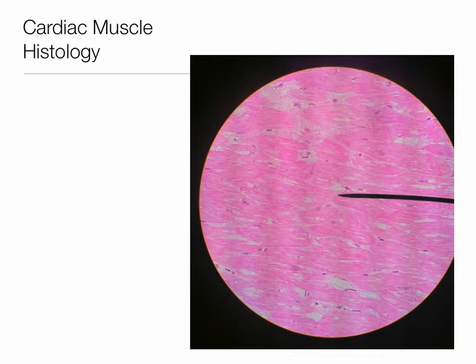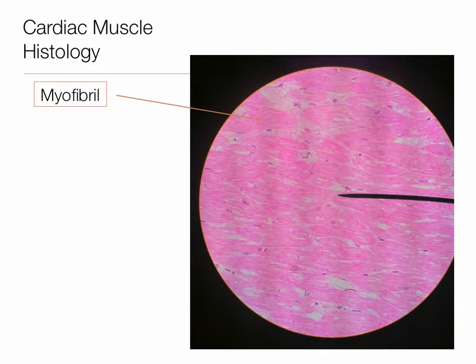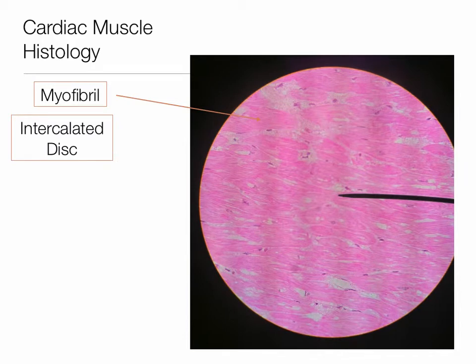You can see the black arrow-shaped marker built into the microscope that allows you to pinpoint and mark things. You can see there's a thinning of the cell and a kind of line that seems to separate one cell from another — you see that appear all over the place in this sample. This little line is a characteristic structure associated with cardiac muscle histology. Let's take a look at the histological characteristics of myocardial tissue. It's called a myofibril — this is where I have the actin and myosin involved in muscle contraction, and that's the majority of what we see: the myofibrils. The structure I was alluding to is something known as an intercalated disc.